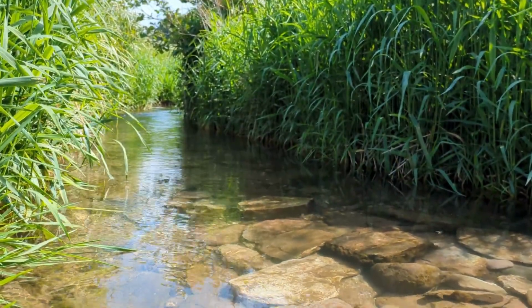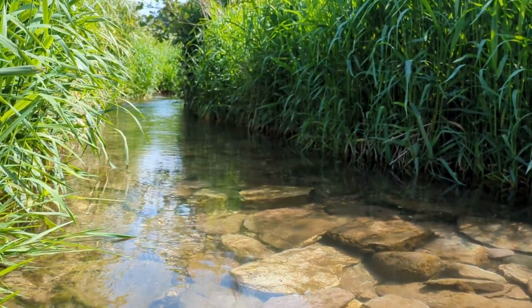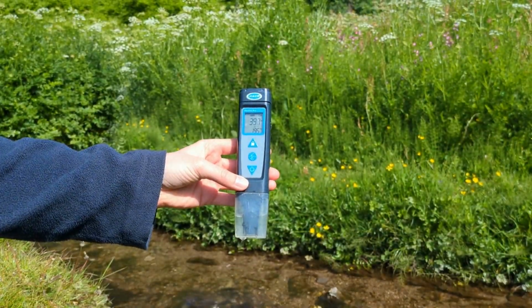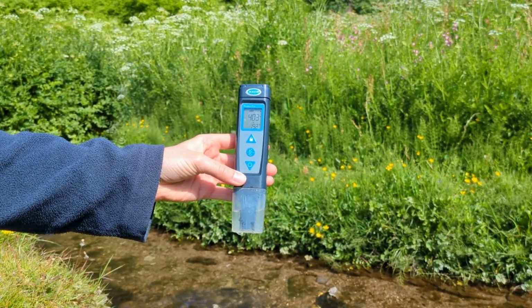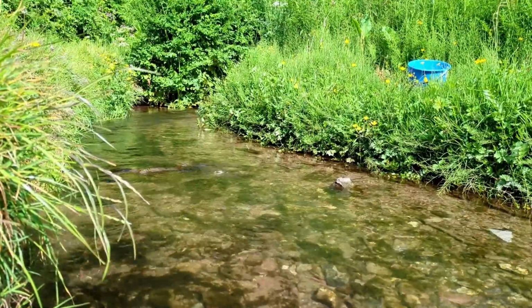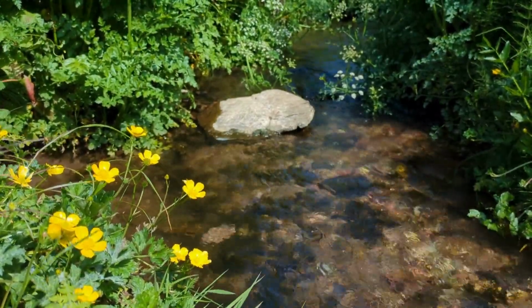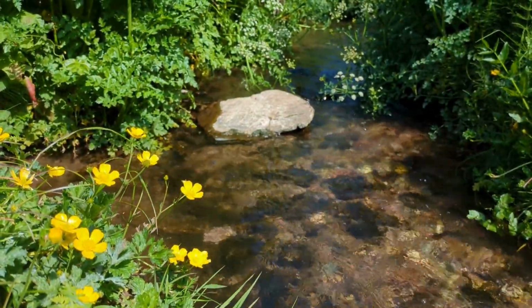Soil is the most fundamental growing medium on land. However, when it washes into our rivers, it reduces the amount of sunlight available for aquatic plants to photosynthesize. It can also introduce toxic substances such as heavy metals and bacteria, and it can smother the riverbed, reducing dissolved oxygen available to fish eggs in the gravels. As you can see, the sample we have taken looks relatively clear, and turbidity and suspended sediment came out as a low value, which is good news for our rivers.